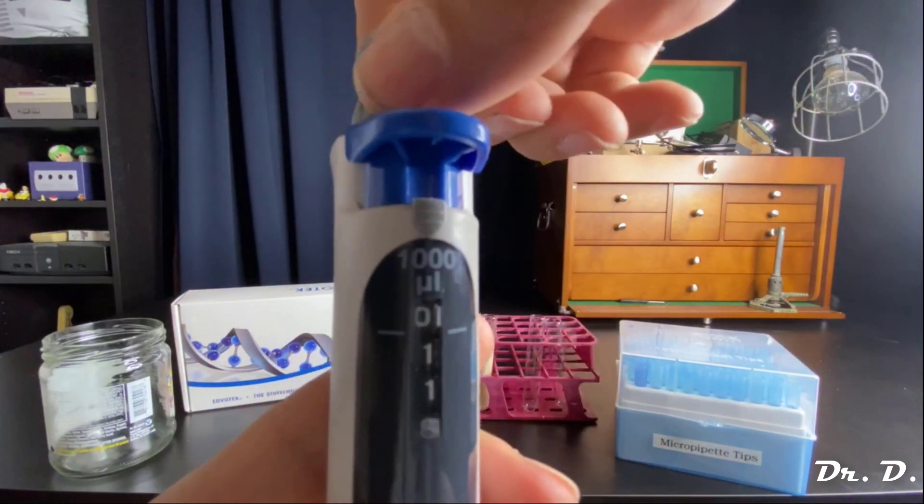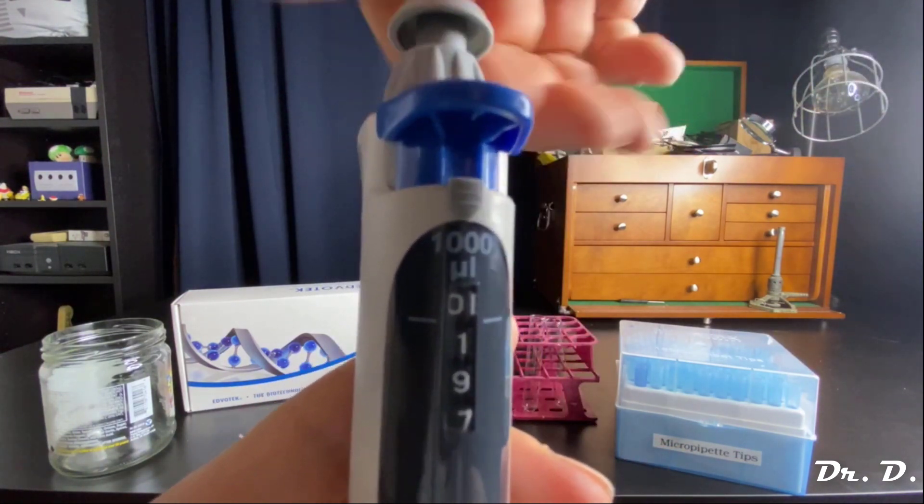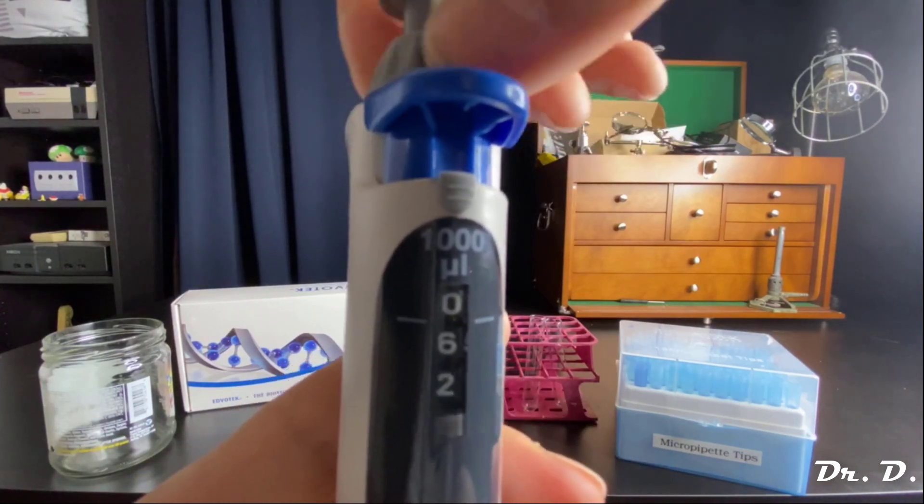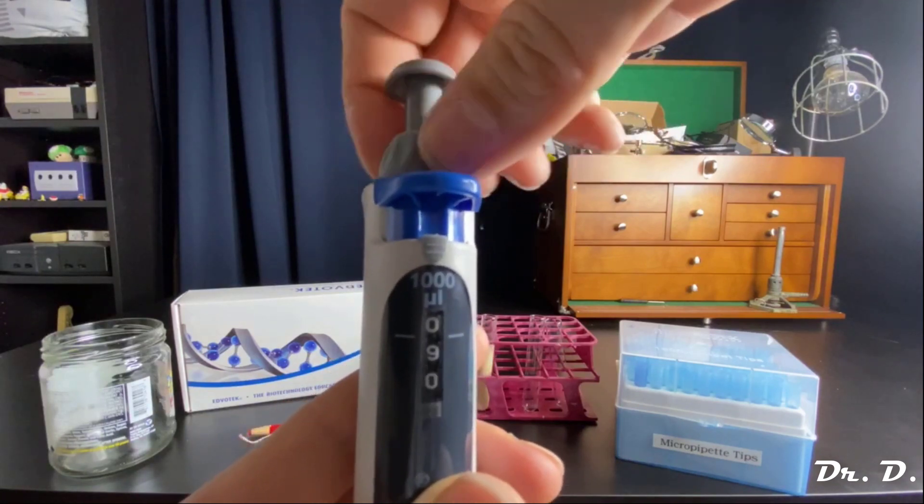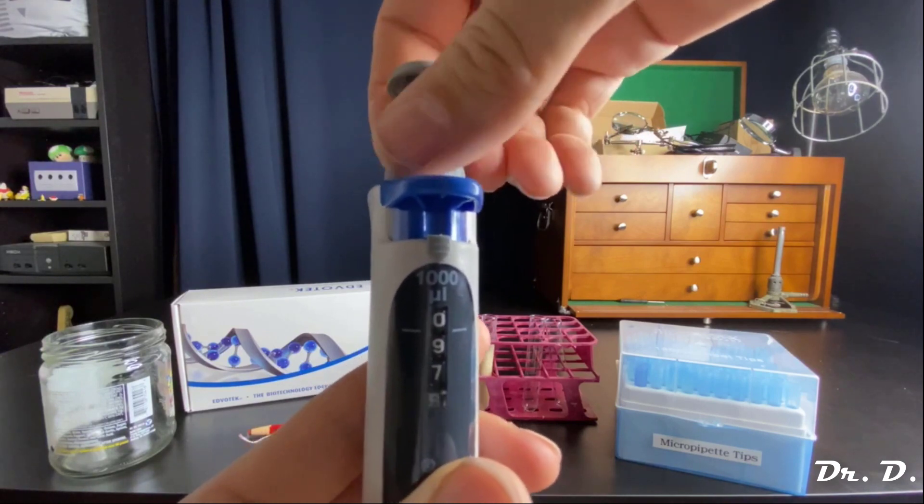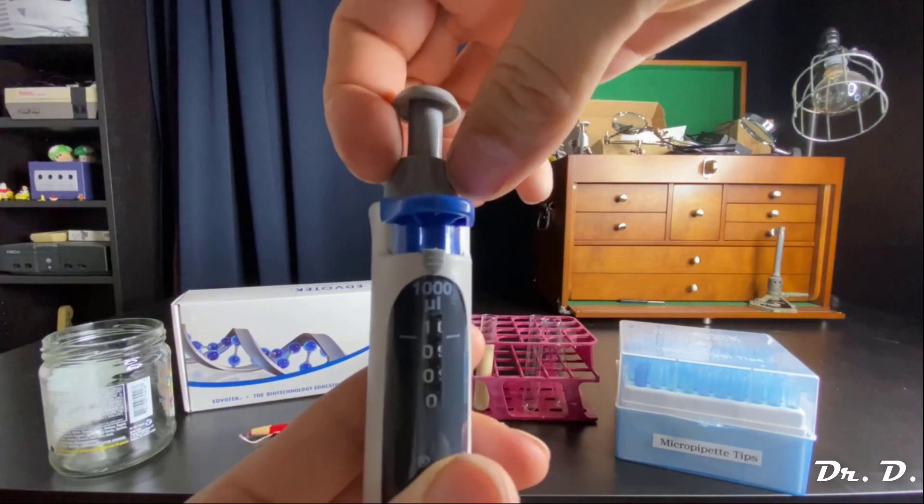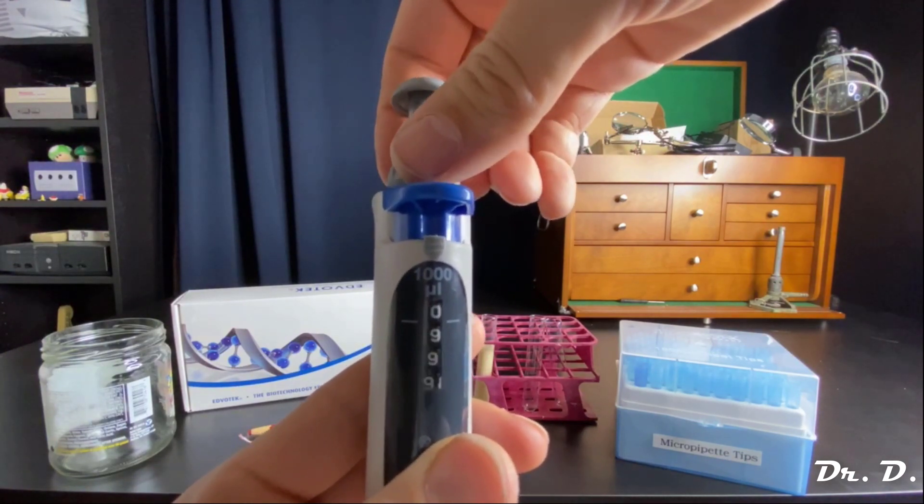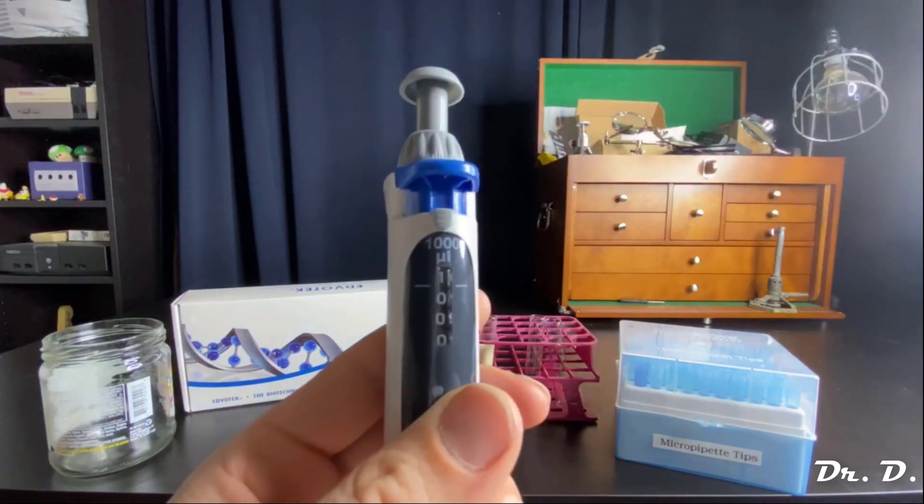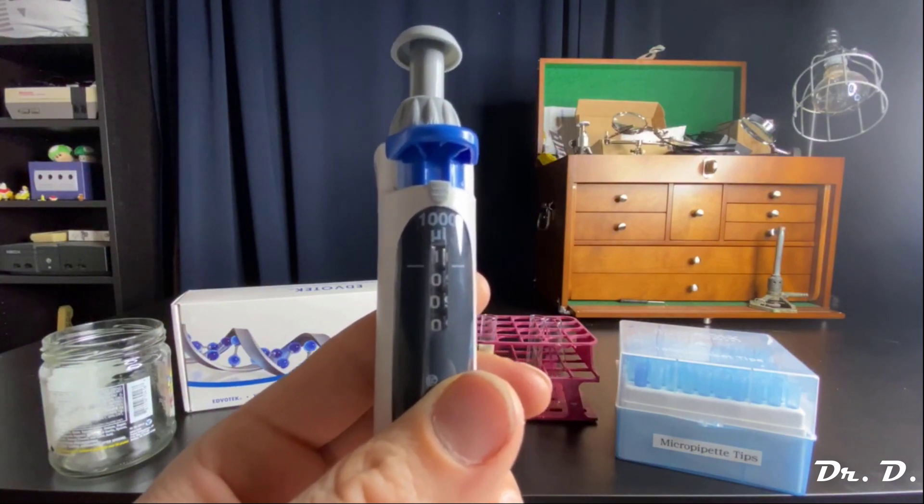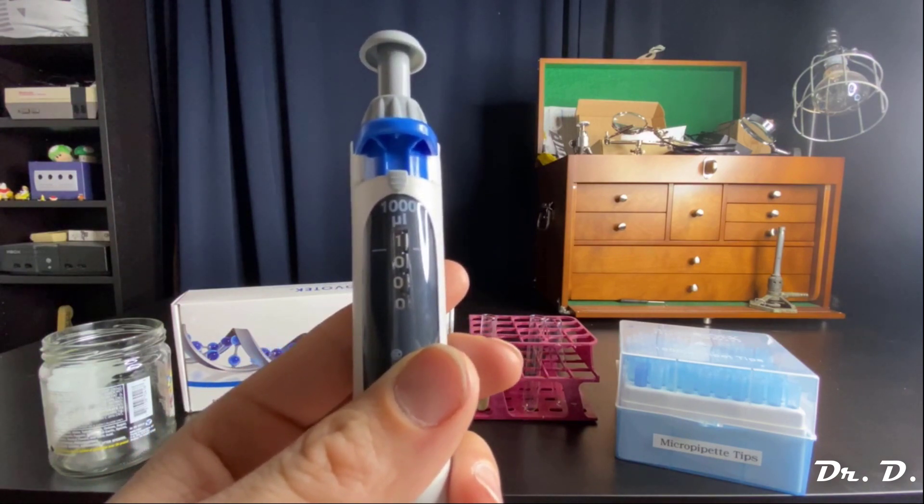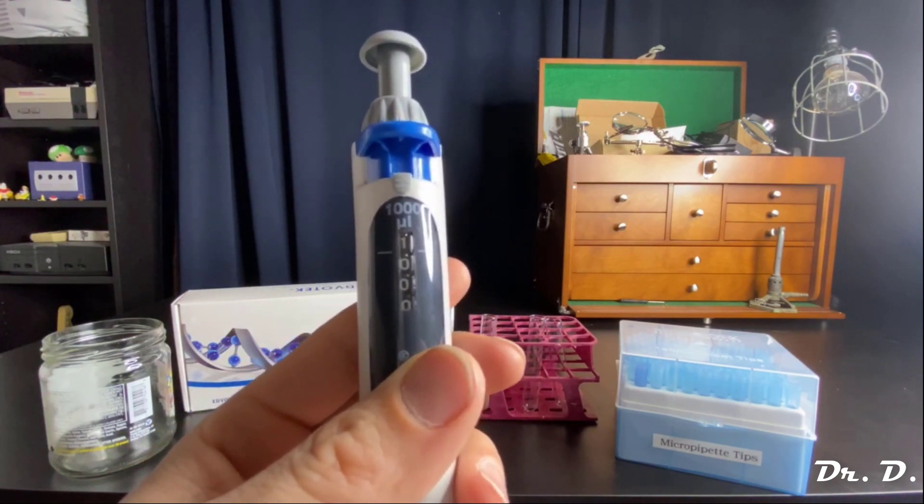The highest setting on this micropipettor would be if we advance it, you have to turn for a while, eventually you reach and roll the odometer over. Here we go. One, zero, zero, zero. That is 1000 microliters. So right now, the micropipettor is set to 1 milliliter or 1000 microliters.